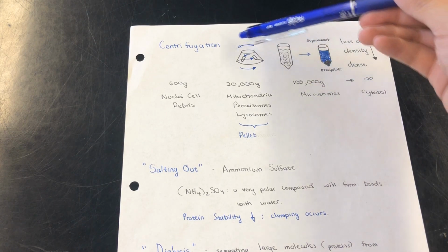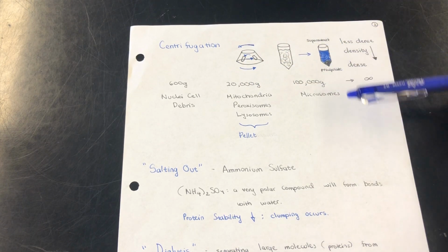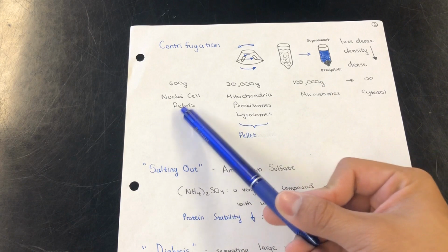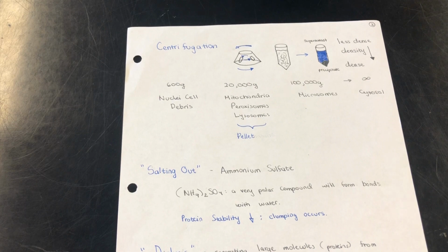Once you centrifuge it, you have a separation between supernatant and precipitate. Dense materials tend to go towards the bottom and less dense will go to the top. And at different speeds, you're going to get different material, for example, the mitochondria in the pellet at 20,000 Gs.